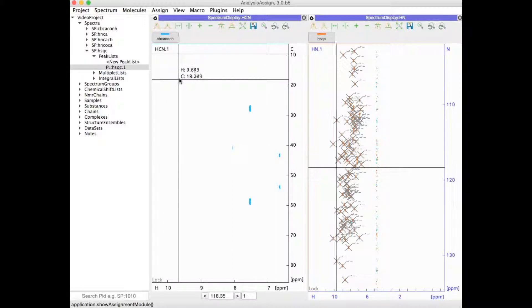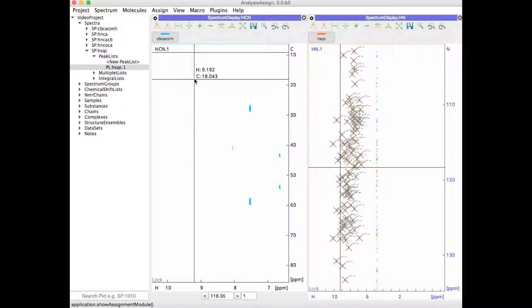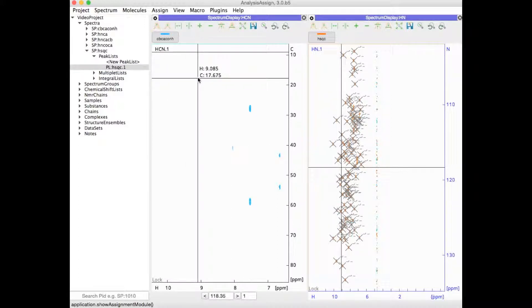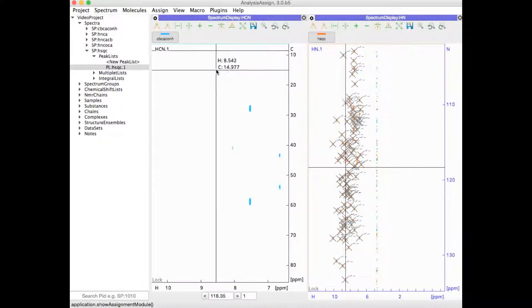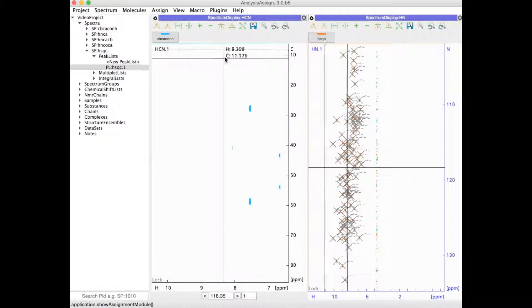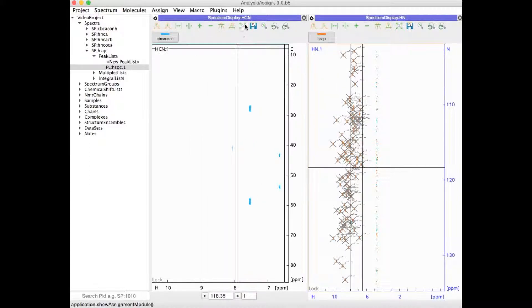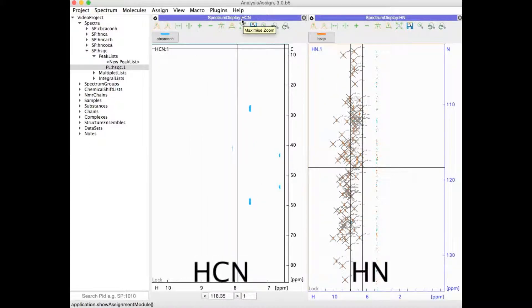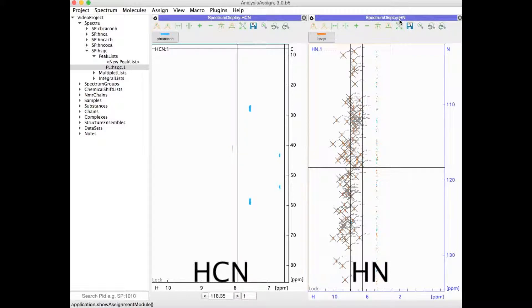Note that the spectrum modules are all associated with a particular arrangement of axes as shown at the top of the module. On the left-hand side, we have an HCN module. On the right-hand side, an HN module.